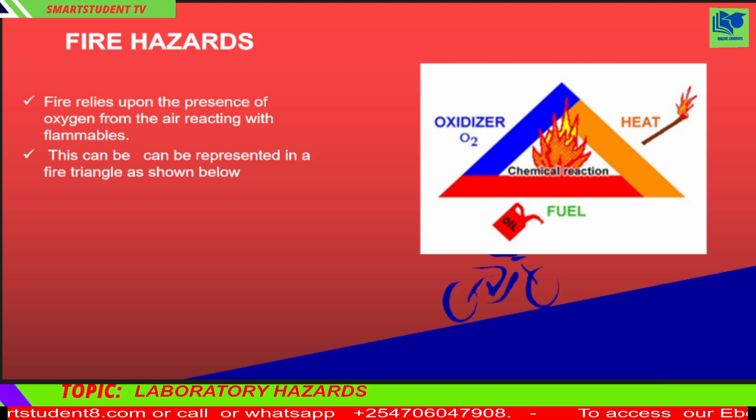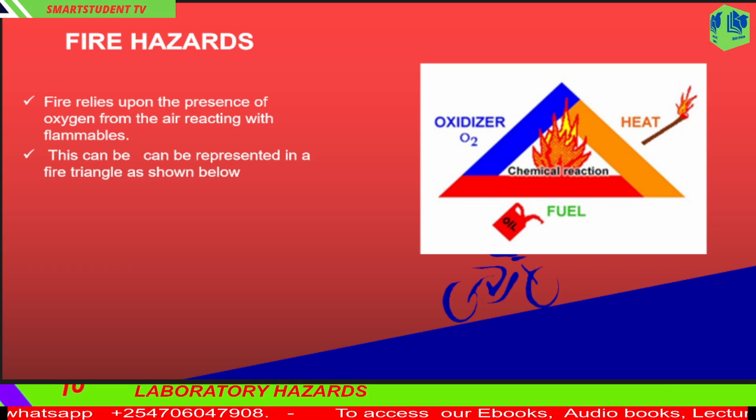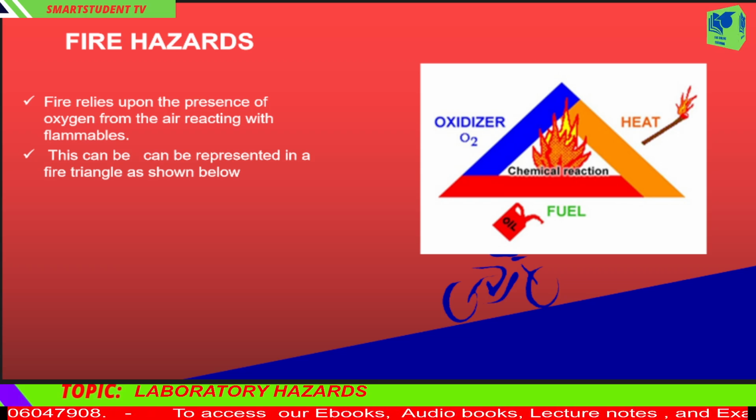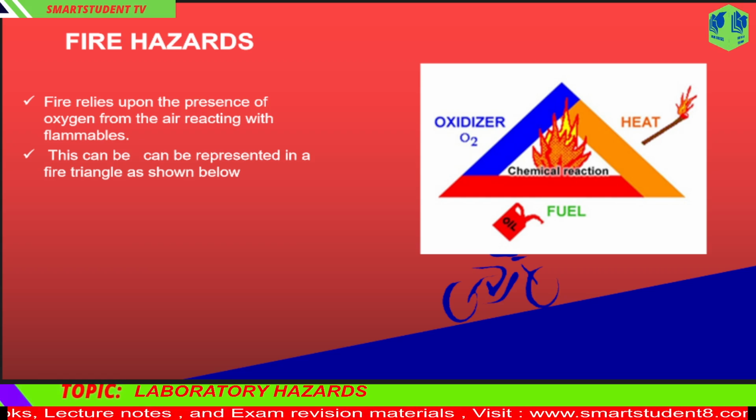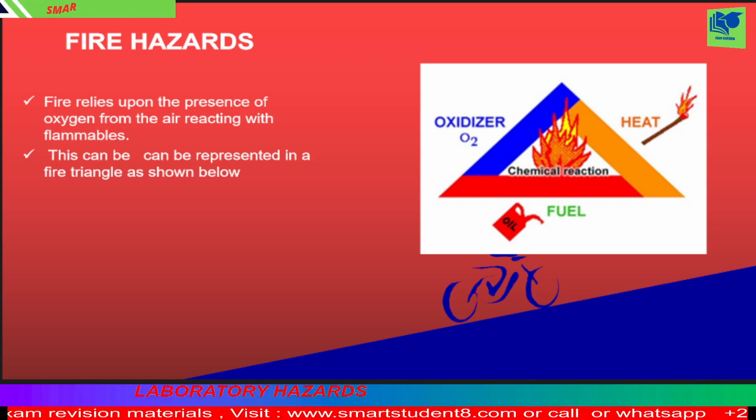Class, fuel examples, fire extinguisher. A: solid organic carbonaceous material: rubbish, wood, paper, textiles, etc.; water, carbon dioxide, foam, dry powder. B: liquids or easily melted solid organic compounds: petrol, ethanol, plastics, etc.; carbon dioxide, foam, dry powder but not water. C: flammable gases: petroleum gases; carbon dioxide, foam, and dry powder. D: flammable metals: sodium, magnesium, etc.; dry powder, carbon dioxide. E: electric faults: carbon dioxide, dry powder but not water.